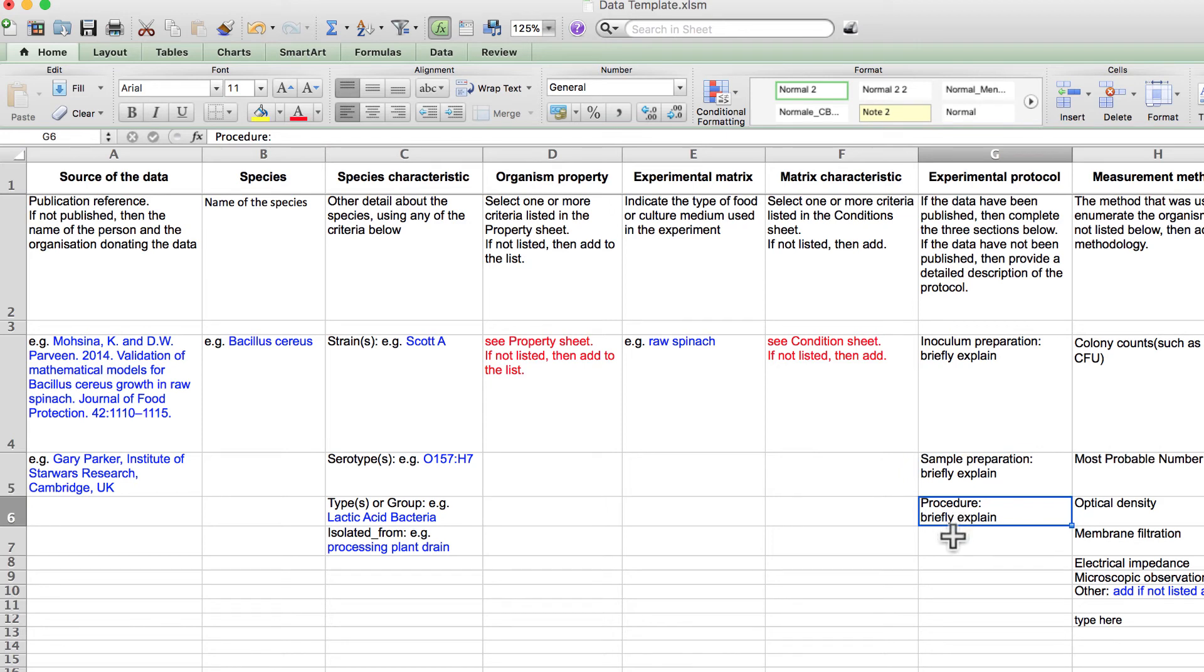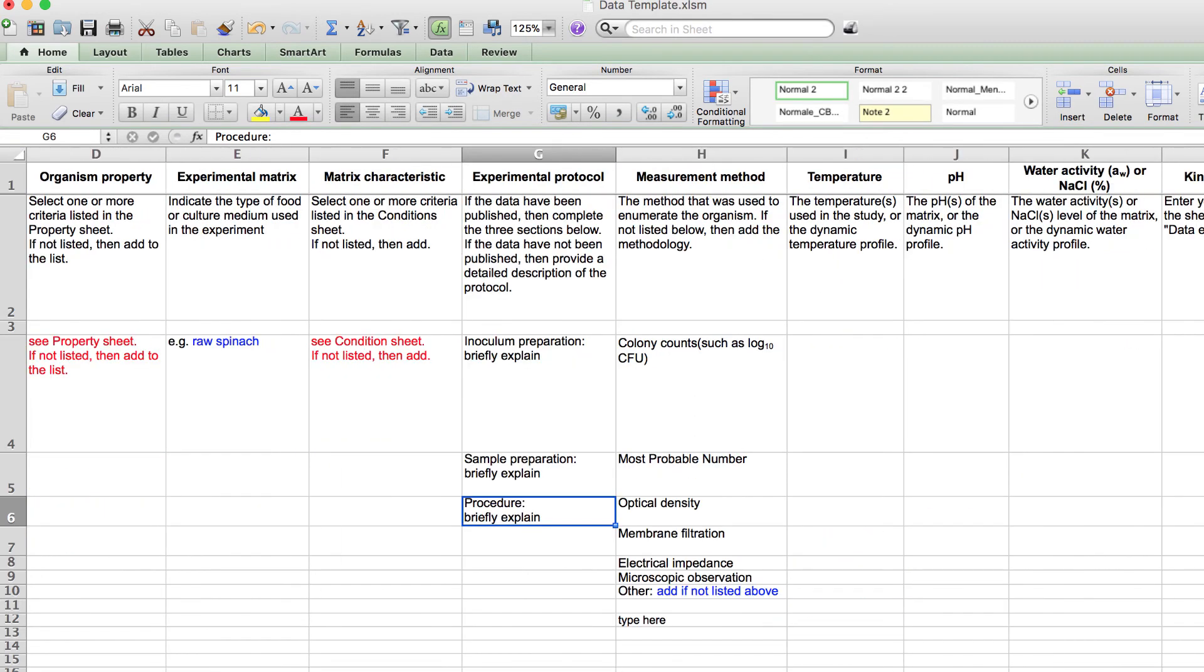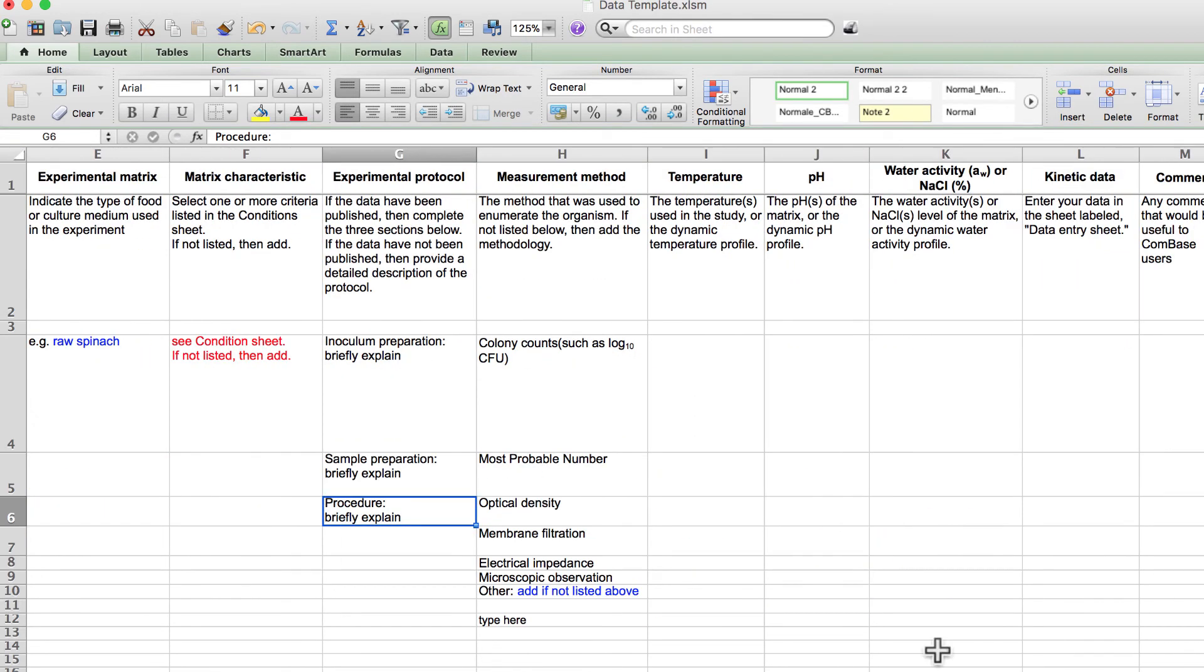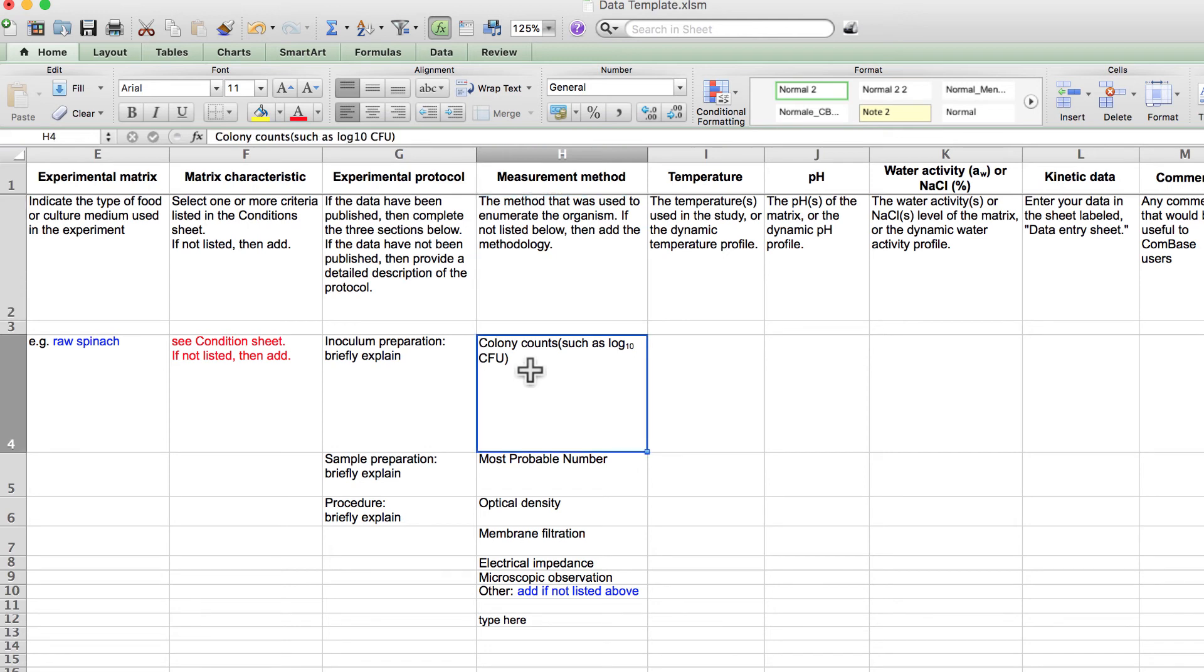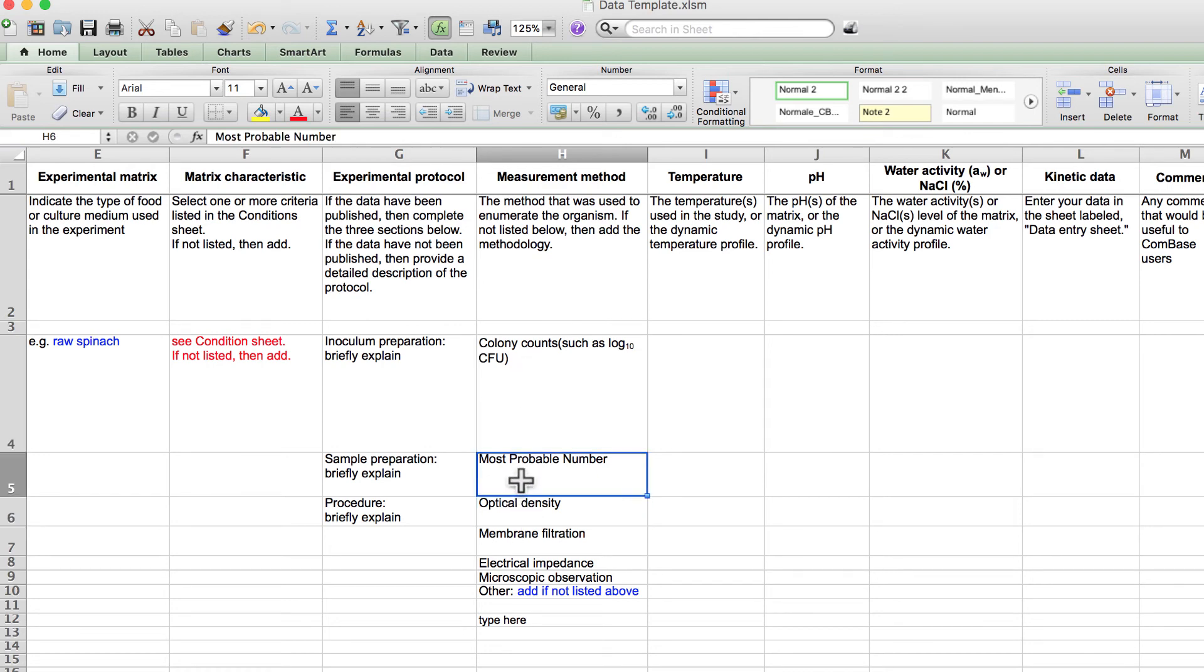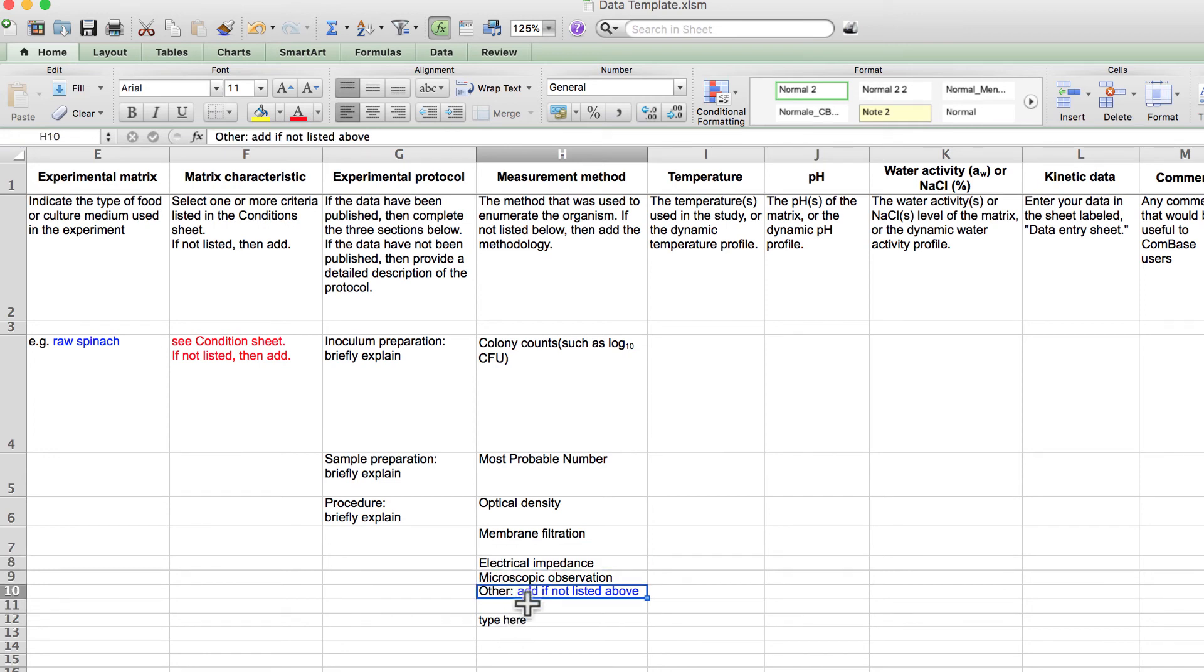Column H is the measurement method. This is the method that you use to measure the growth or death of the microorganism. This may include colony counts, such as colony forming units or CFU, optical density, most probable number, membrane filtration count, microscopic count, electrical impedance, or some other enumeration method not listed here.